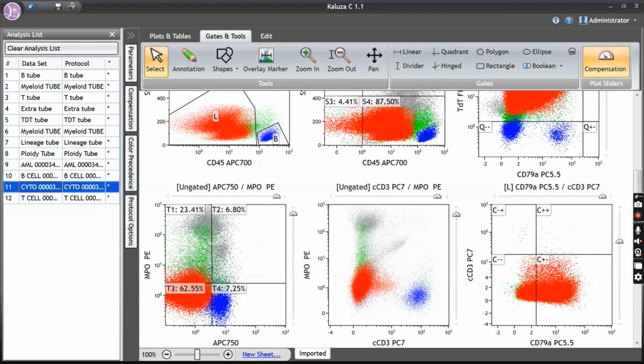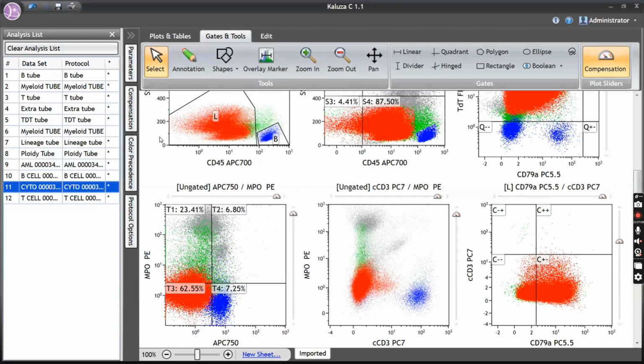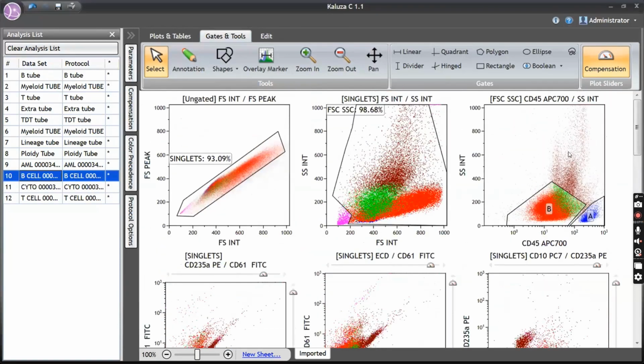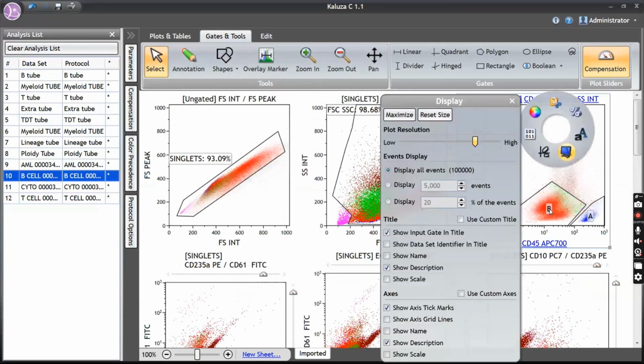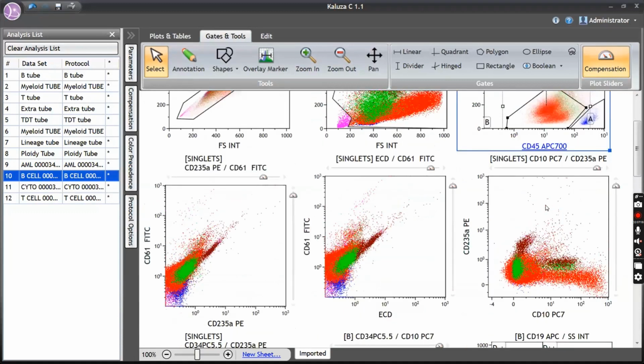So there is one more question, sir. In the first gate itself, why didn't we analyze both the blast populations separately? The answer is, why didn't I analyze 2 populations? Especially with respect to side scatter, I can find 2 populations, but why should I analyze them separately? I would allow the blast to fall somewhere in other plots. It should get separated, right? I didn't find these 2 populations getting separated in other plots. So when it is not separated in other markers, there is no point.